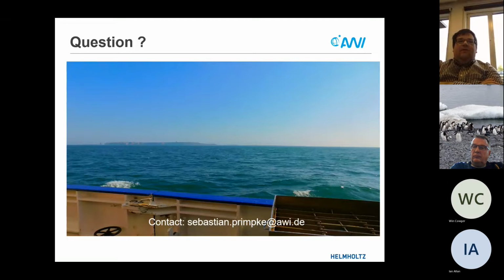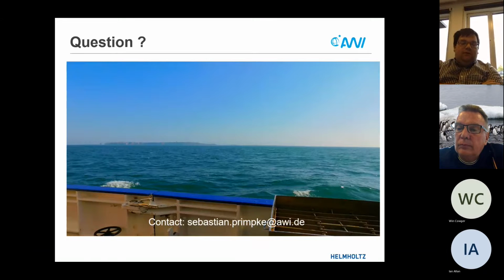What we often see now is that people just trust the database and do not think about how often this material is used. I've seen this especially when using a system for Thermo. They just reproduce what the system was giving out. And then you say, this is a water-soluble polymer. That doesn't make sense.